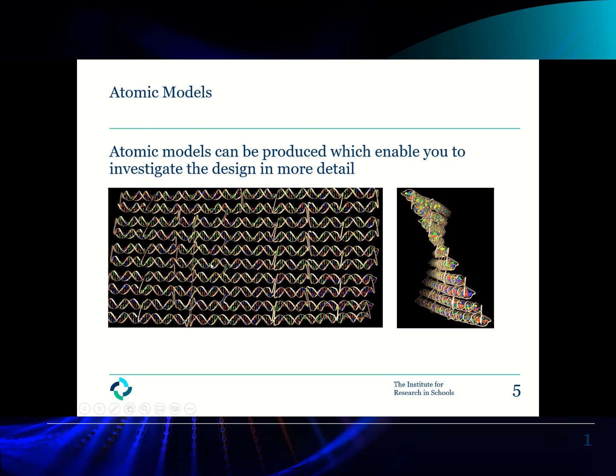And hopefully, if you've created the right dimensions for your designs, as well as the right editing within the files, it will be possible to send this back to you as well. As you can see, some of the junctions here go from the bottom of one double helix to the top of the other, which is adding an inherent strain to these crossovers.